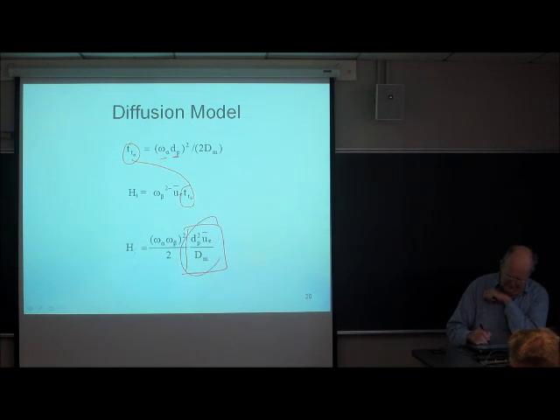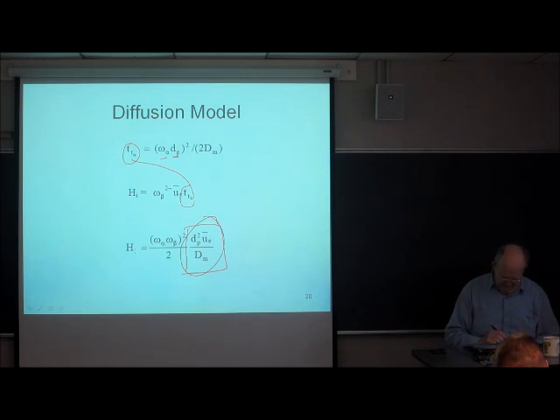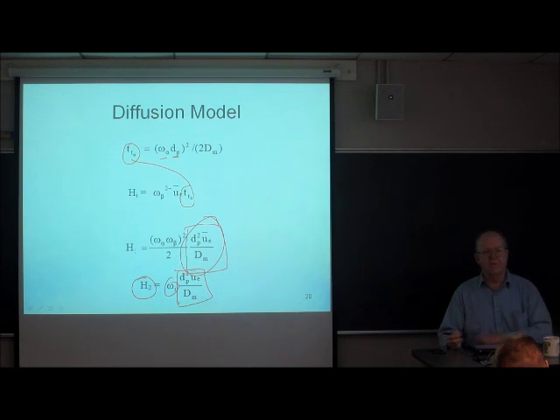And this business here looks an awful lot like what we derived when we did the C term. In fact, it's not really very different from the C term. And if this were the dominant mechanism of mass transfer between flow streams, you would have a hard time telling the difference between this and simple interphase mass transfer. So we lump all that stuff together, and so we say that this H, this contribution, is proportional to that collection of terms.